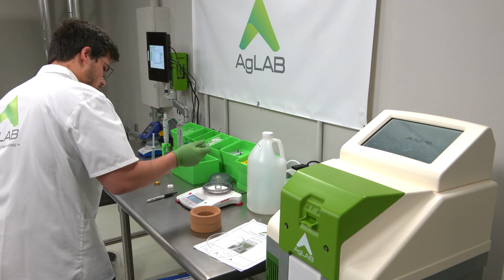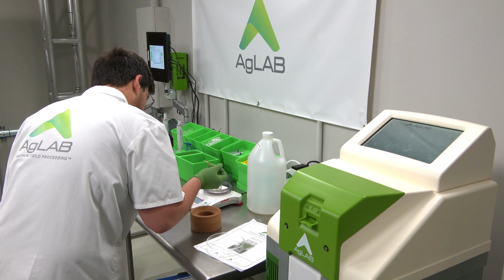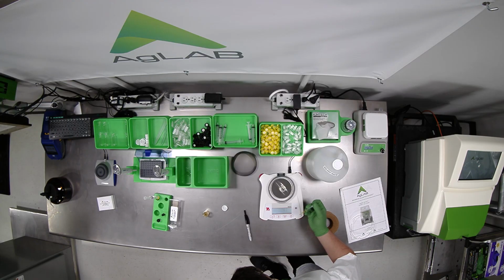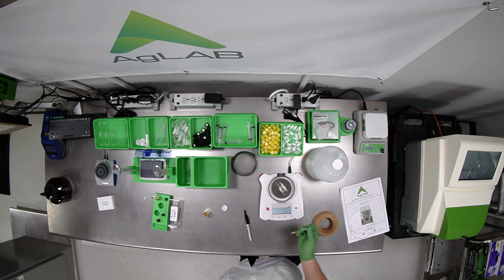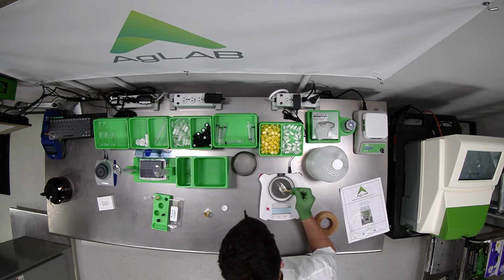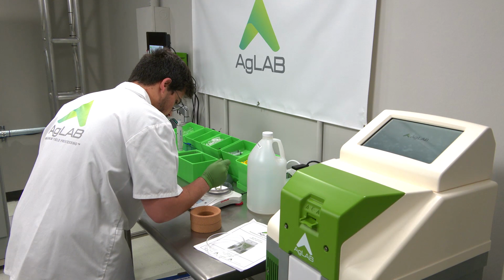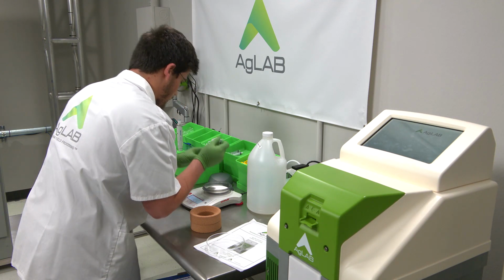43. This will put us in range. We want to try to get our sample weighed out in between 0.040 and 0.060, so there's a plus or minus 10 milligrams there. I'll go ahead and do a tiny drop if I can to try and match the weight perfectly.